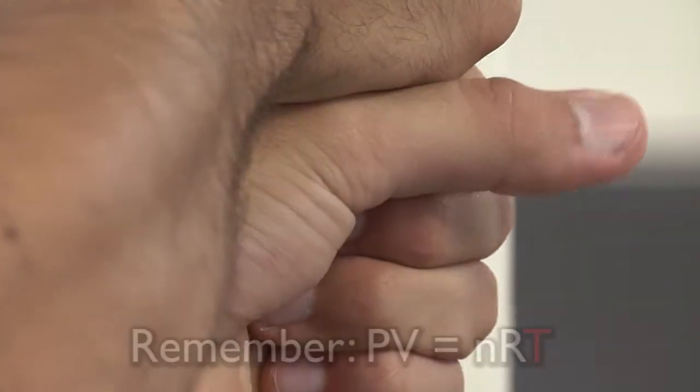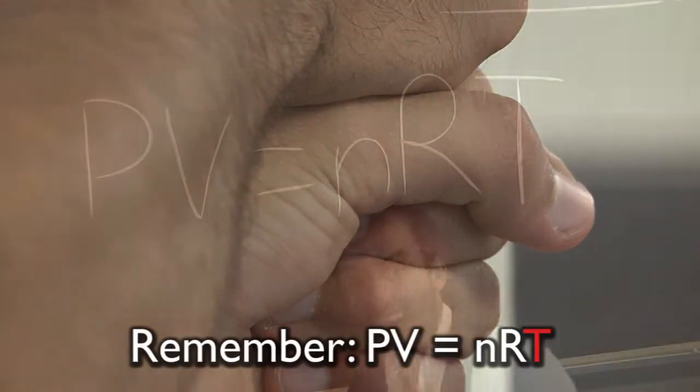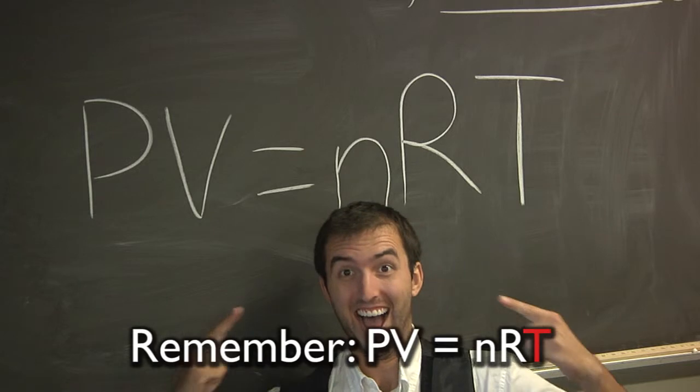Now, if we heat our substance with our hands, how will temperature affect our pressure? Remember, PV equals NRT.